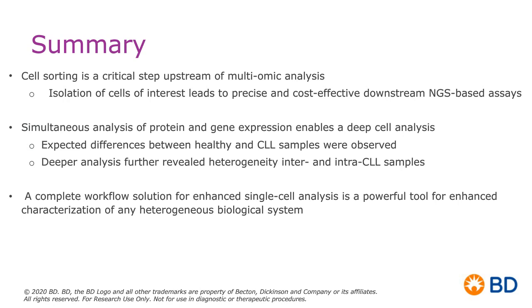So in summary as well, we've talked about how the simultaneous analysis of protein and gene expression really enables deeper cell analysis, and that we observed a lot of the expected differences between healthy and CLL samples, and that this deeper analysis further revealed heterogeneity both inter and intra CLL samples. And ultimately, a complete workflow solution for enhanced single-cell analysis is a powerful tool for enhanced characterization of really any heterogeneous biological system.